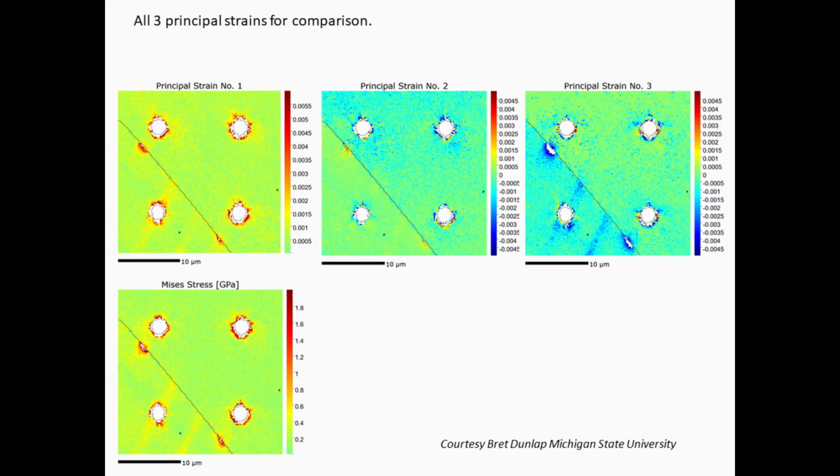I don't like to think of it the way we map it, as the von Mises stress criterion. It's an energy criterion, and this is energy per unit volume. Now if you think of it as an energy per unit volume map, then you see where your energy is building up. I don't consider things around the nano indents to be of importance.